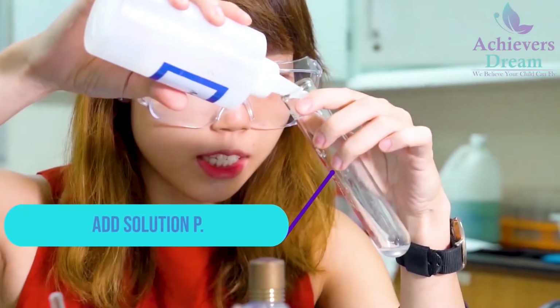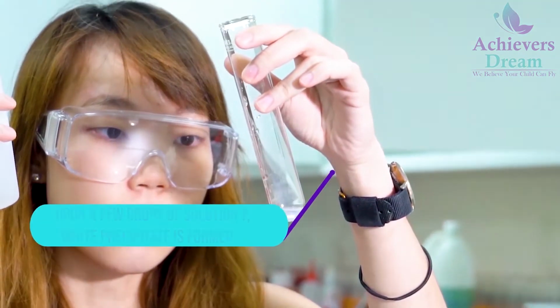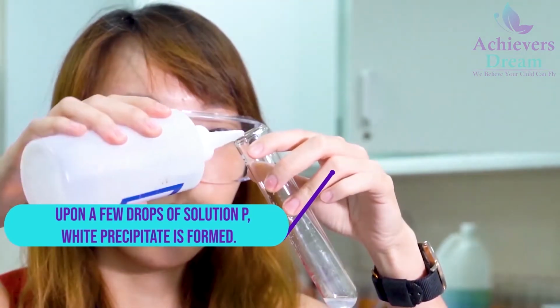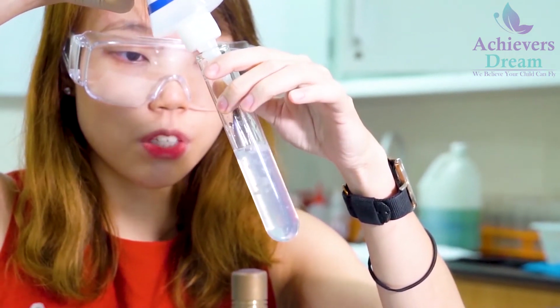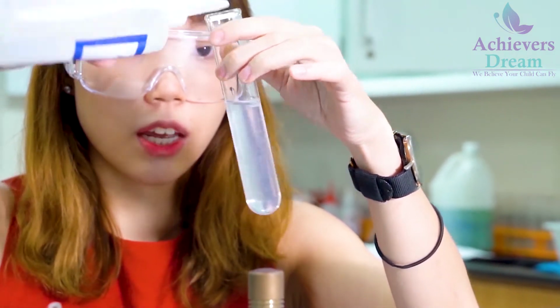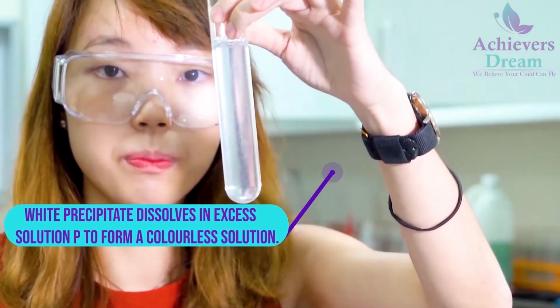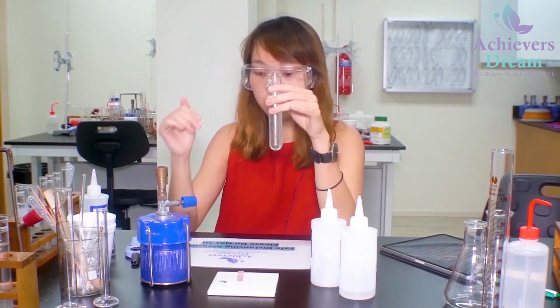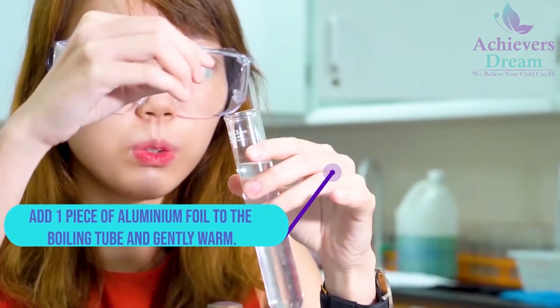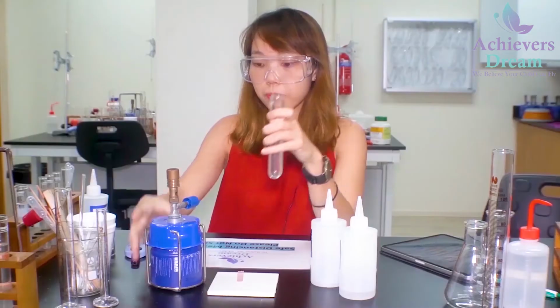So first dropwise, okay, upon a few drops of aqueous ammonia, you notice that there is presence of white precipitate. So now I'll be adding in excess. Okay, so you see that your white precipitate has dissolved to form a colorless solution. Okay, so the next thing I'll be doing is to add 1 piece of aluminium foil into this boiling tube, and I will gently warm the mixture.